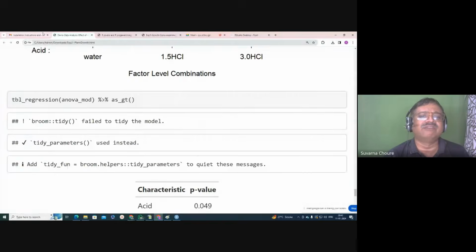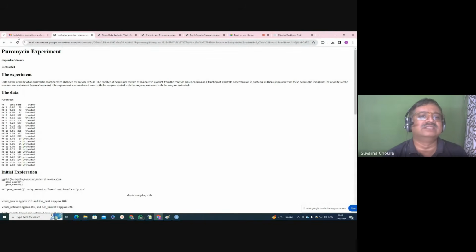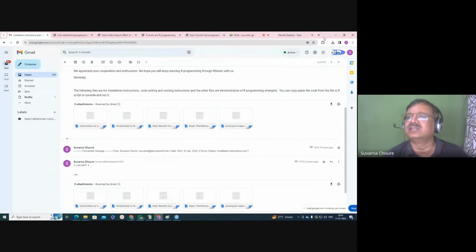The other file which I shared with you is the Puromycin experiment. That Puromycin experiment, I have to download that and run that.